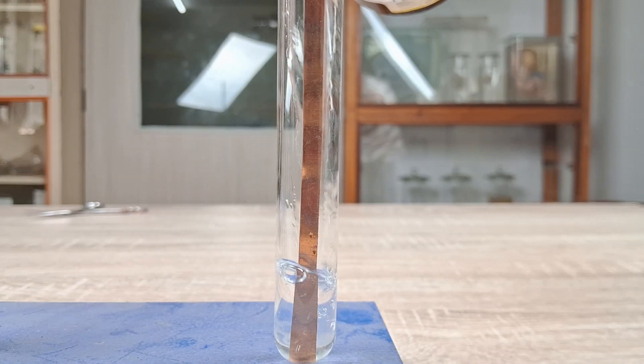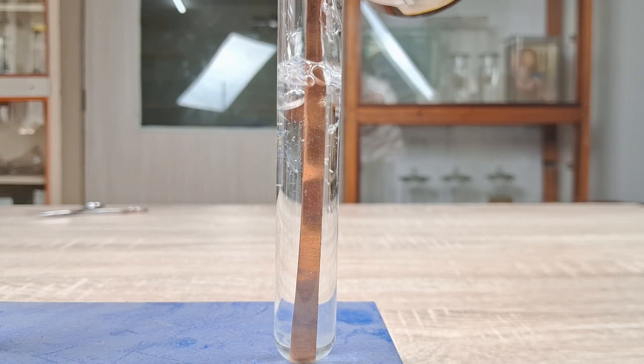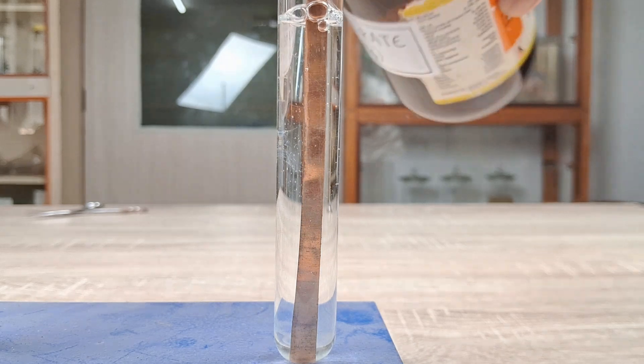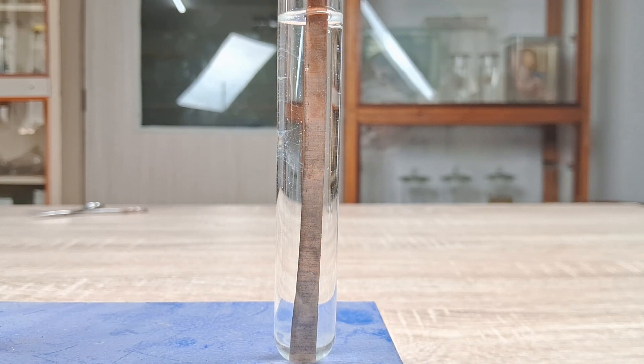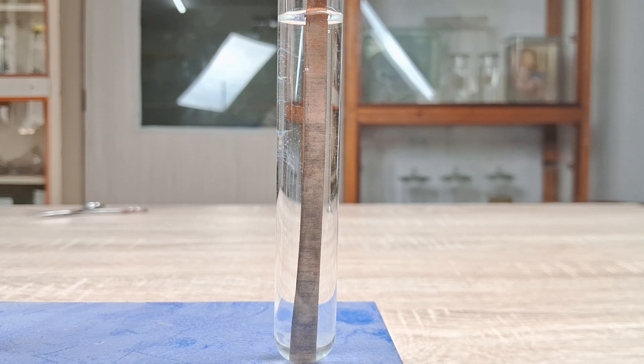First take the strip of copper and place it into the test tube. Next pour the silver nitrate solution into the test tube so that the copper strip is completely immersed in the solution.